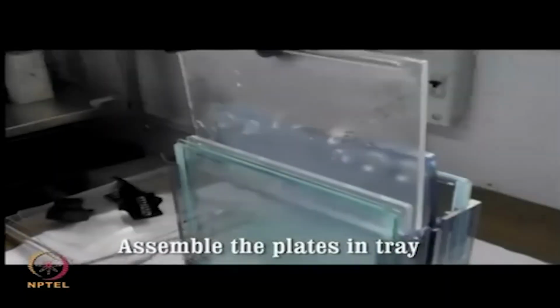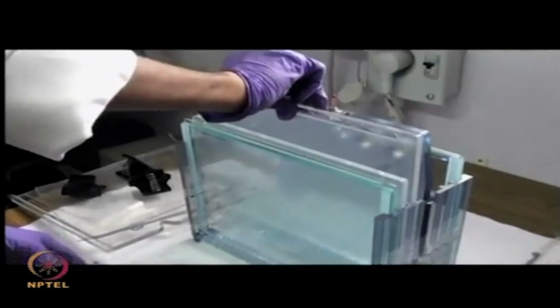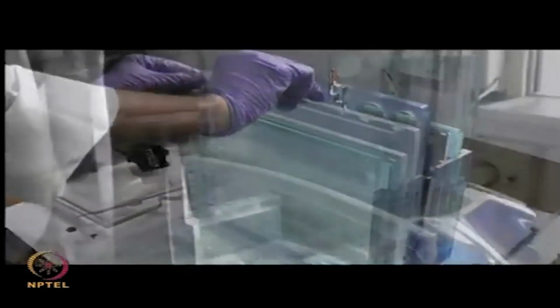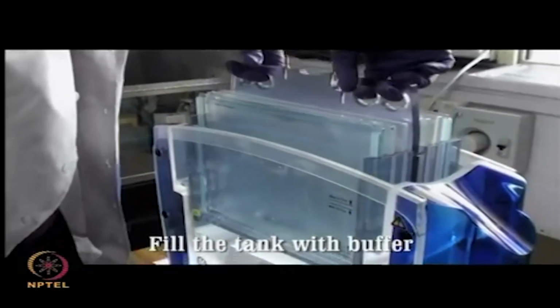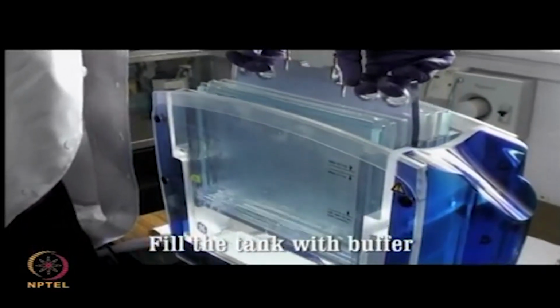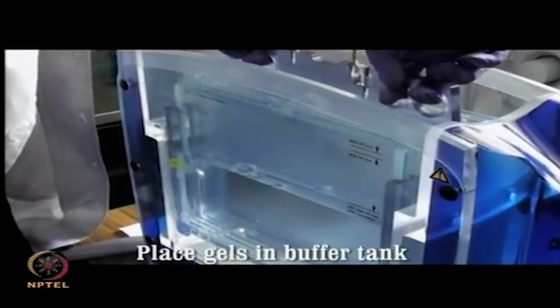Assemble the remaining plates in the gel assembly and carefully lower the entire apparatus into the gel tank containing the buffer solution. Ensure that the buffer level does not rise above the mark indicated.